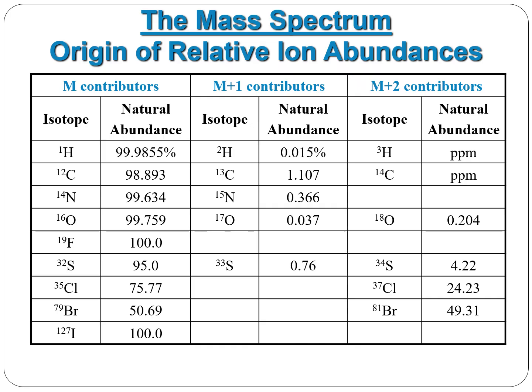Here are just some examples of the relative abundances of some of the elements that we may see. Our molecular ions or M+1 contributors. The one that our syllabus will most likely ask us to look at is going to be your carbon, carbon 12 and carbon 13.